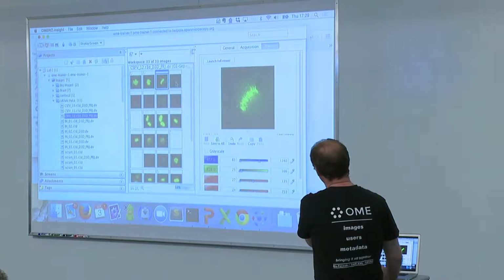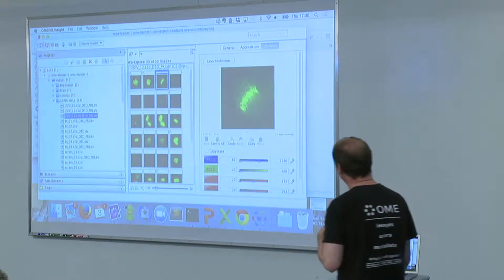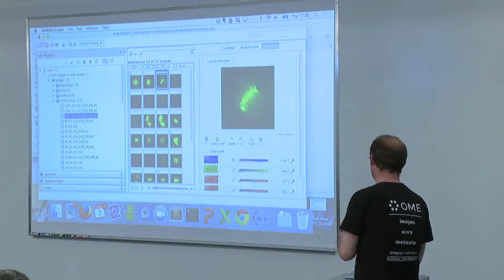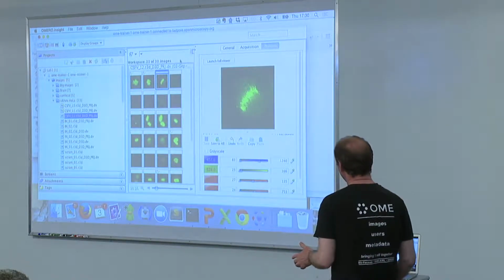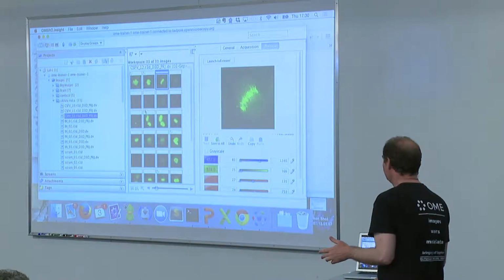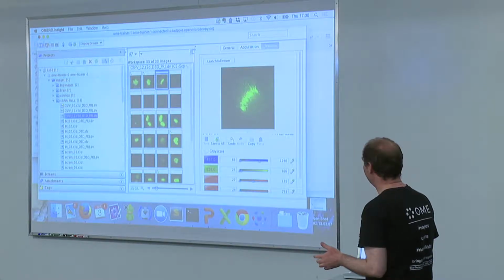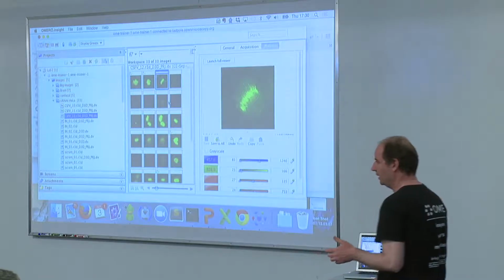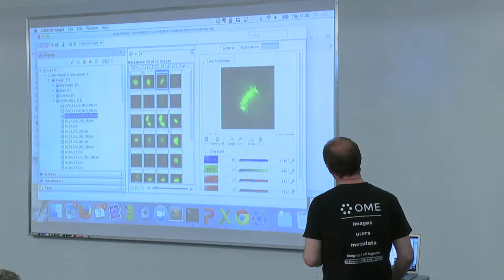Now you can see that the rendering settings which I set for the one image will be propagated to all images. So say, for example, I have used a fluorescent probe to look for my siRNA, and this is in a green channel, and I know that this will give me already a first taster of how my experiment looks if I compare the three controls in the first row and then the other images here. Okay, so this would be one type of batch actions.